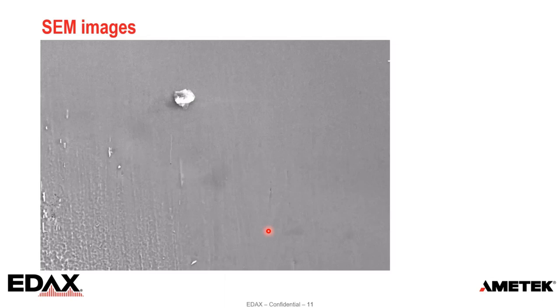The SEM images are collected after every single heating step. And these images are put together as a video to see if there are differences on the surface by changing the temperature. So I will play the video and we will see what will happen during the heating process.